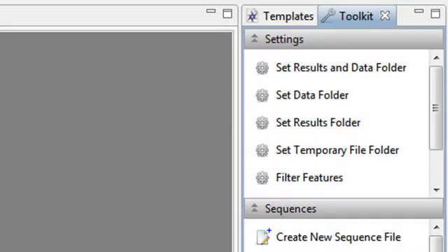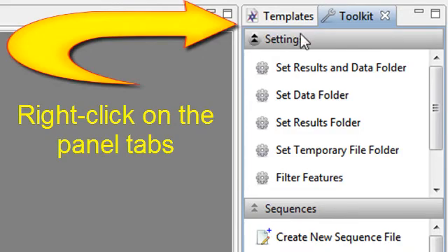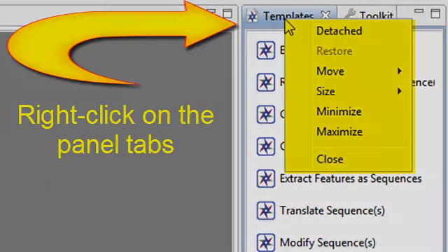As in our Protein 3D application, SeqNinja's panels and views can be resized, moved, closed, or undocked if desired.